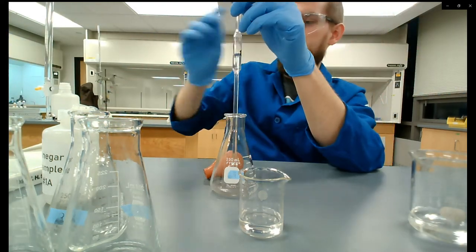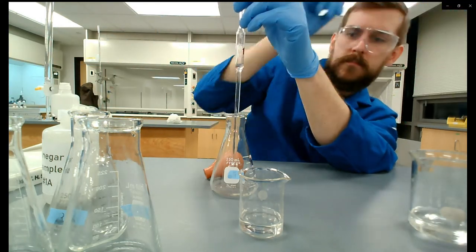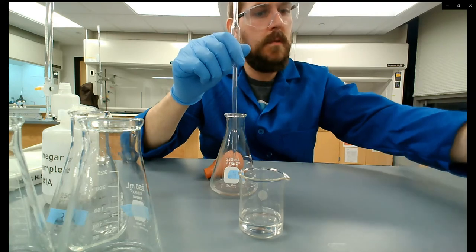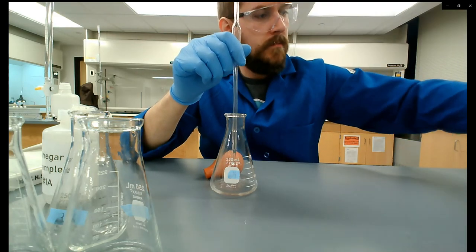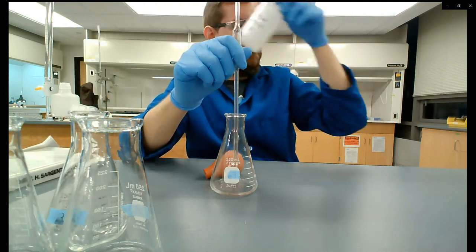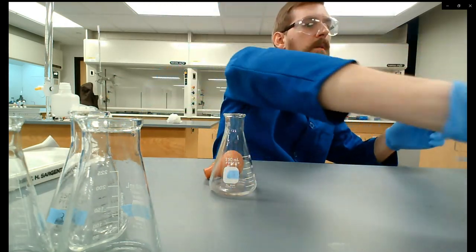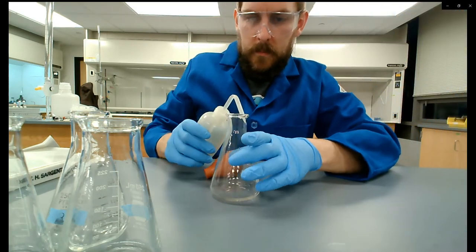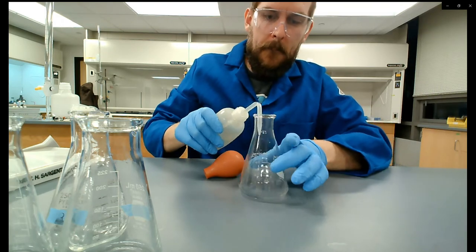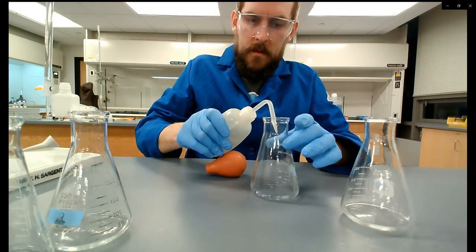While this drains I'm cleaning up my area and getting things out of the way. I've got my four Erlenmeyer flasks filled with 10 milliliters of vinegar solution. Now I'm going to rinse all these because I've tapped some of the acetic acid solution to the sides of the flask. I want to rinse the sides down so all of it is at the bottom before I start titrations.